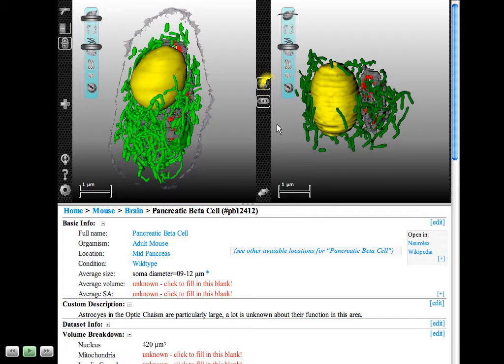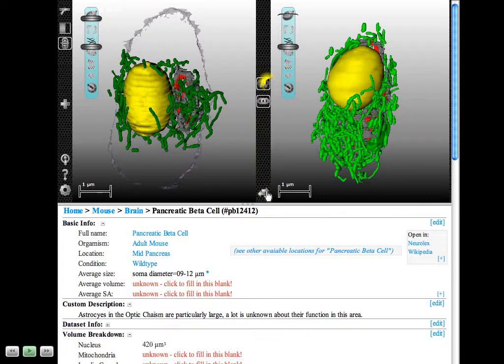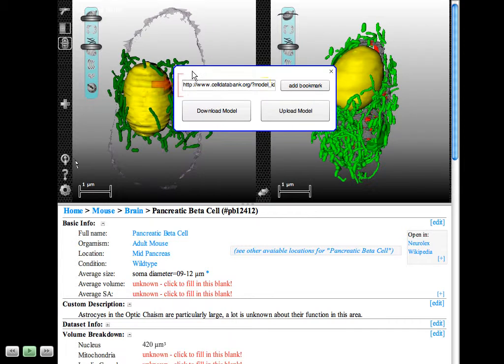Some of the final buttons we can see in this interface is this one to flip the left and right. This button can show a little information about the model itself. This one brings up some basic help, so we know what the mouse buttons do and how to navigate. This button is for settings. Also, it'd be nice to have a button to bookmark or show someone exactly what you're looking at, a bit like in Google Maps where you post a link.